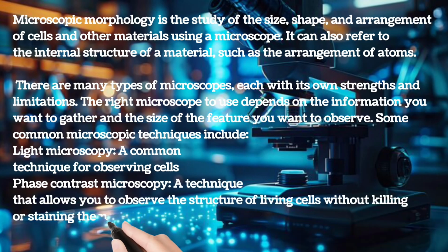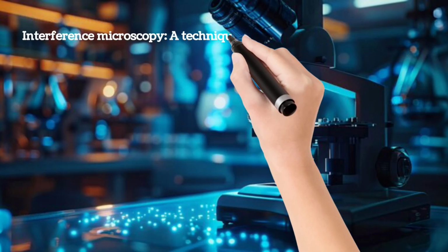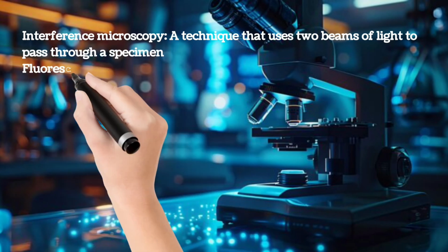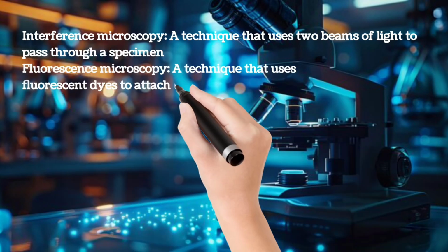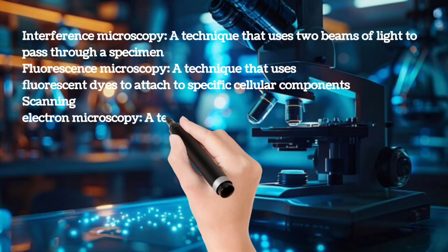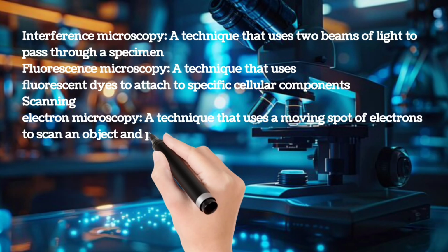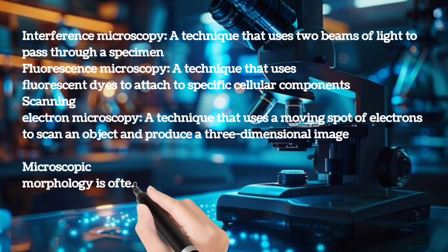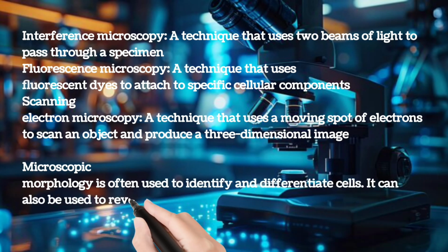Some examples: interference microscopy, a technique that uses two beams of light to pass through a specimen. Fluorescence microscopy, a technique that uses fluorescent dyes to attach to specific cellular components. Scanning electron microscopy, a technique that uses a moving spot of electrons to scan an object and produce a three-dimensional image.